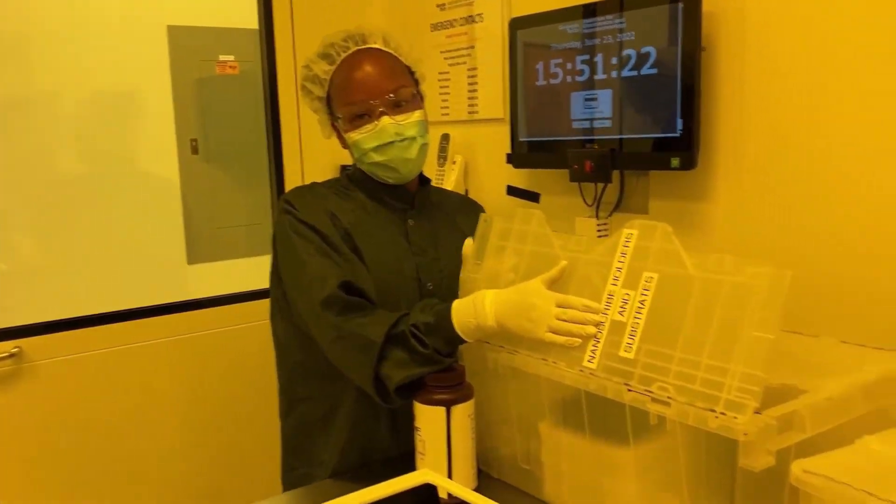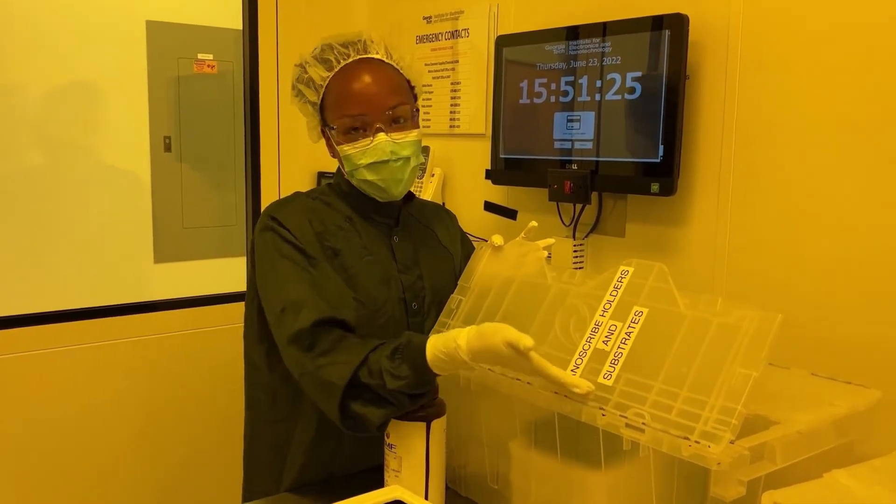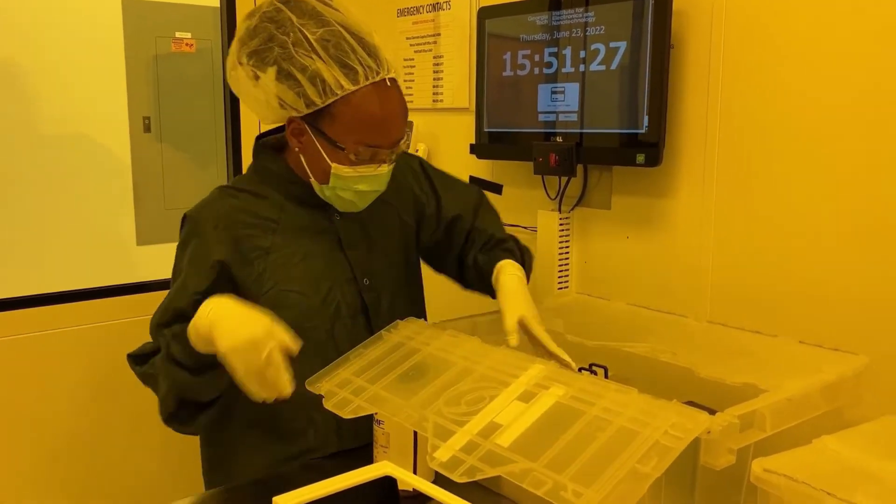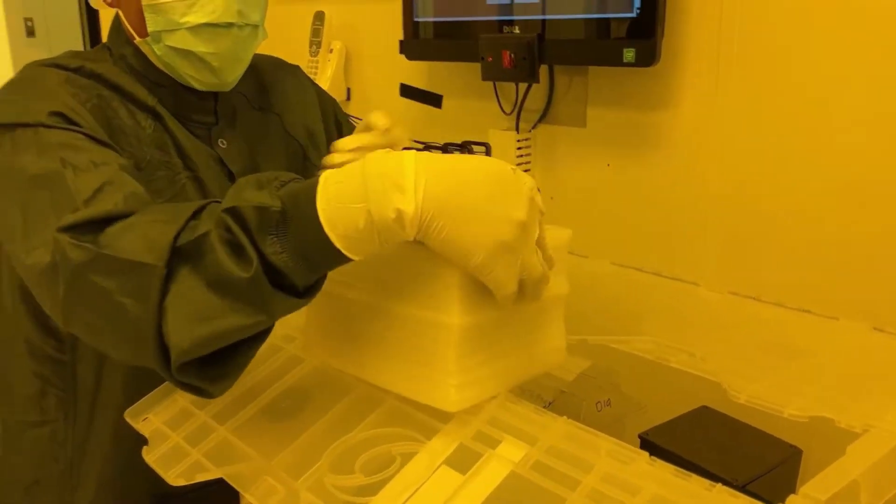Start at the box by the door. This will have different substrate holders, substrates, and the multimeter. In general, most things you need to prepare your sample will be found here.